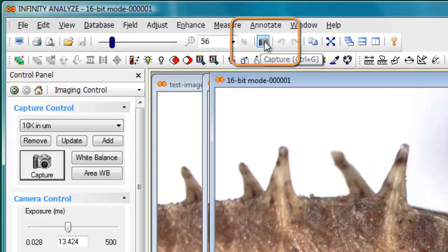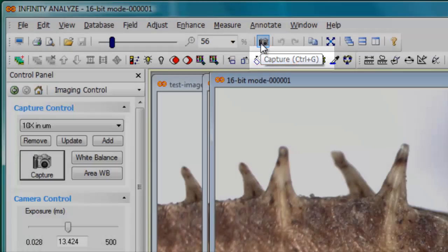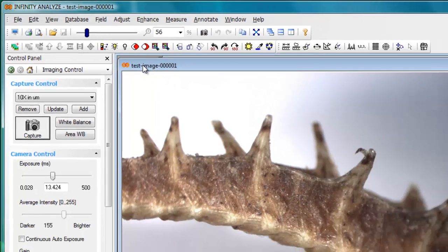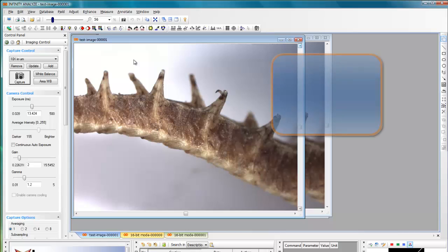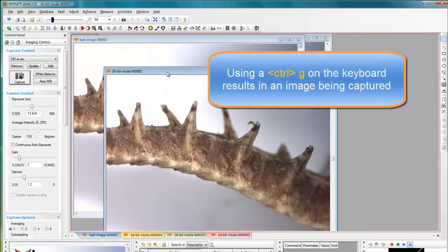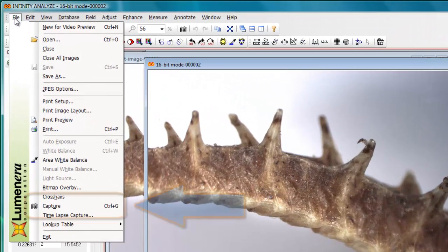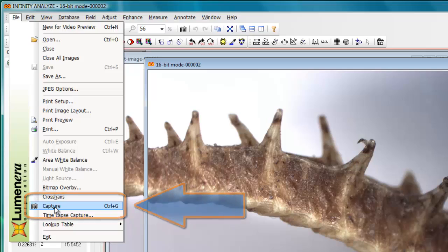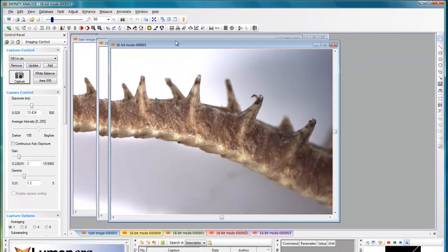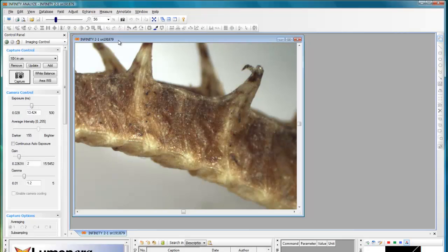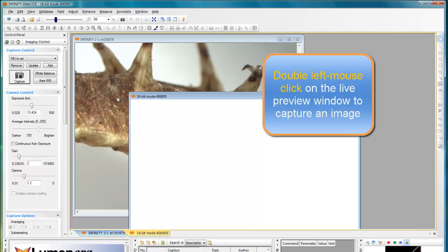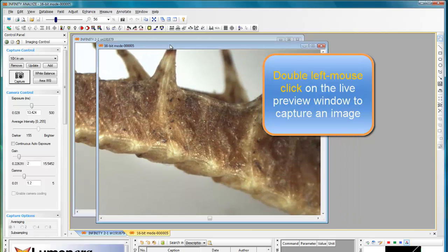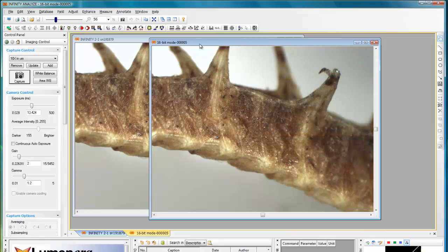Also, if you have the toolbars turned on, you have a capture button up here, where you also see from the tooltip that it says control G. So if I go back to my live preview image and execute a control G, then I get an image being saved. Also from the file menu, I have my capture option on my drop down list and that will capture an image as well. And you can also move your mouse and double left mouse click on the live preview image and get a captured image.